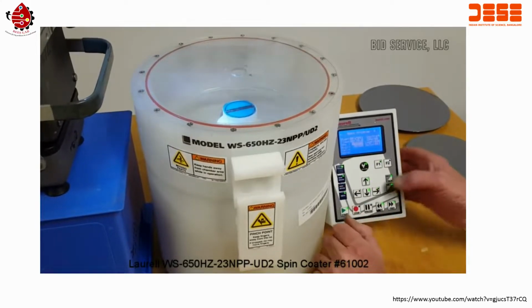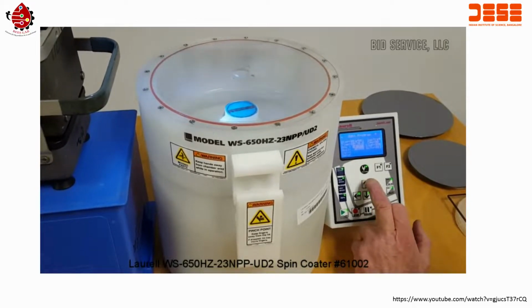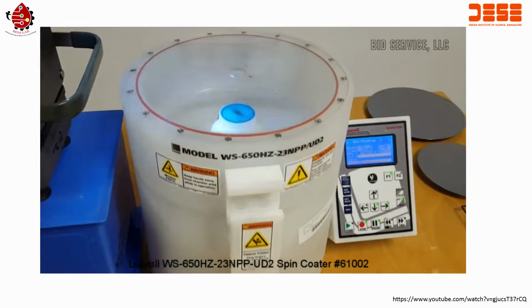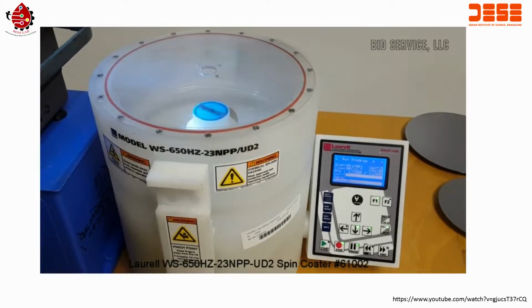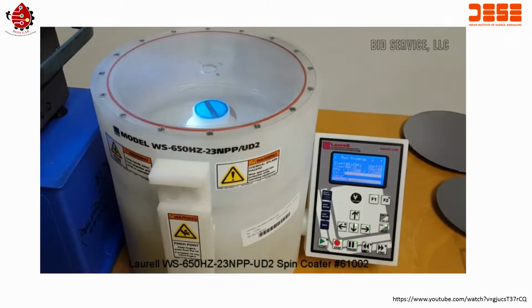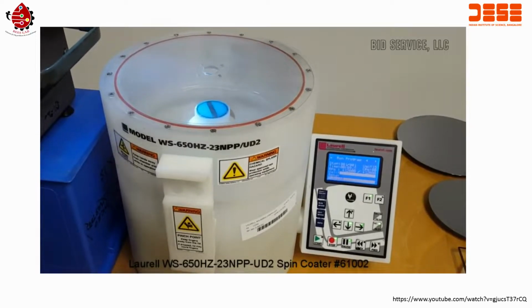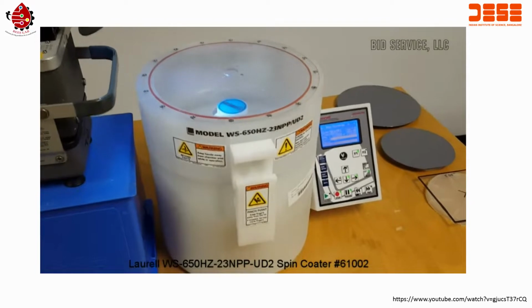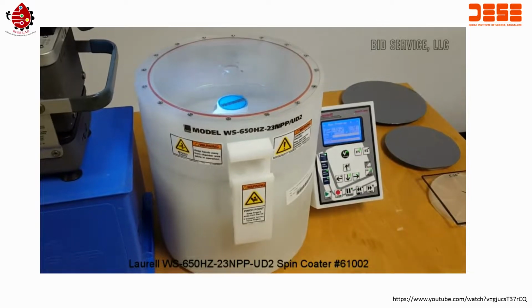We'll do one more spin, and we'll do this at the maximum RPM of 12,000. So, one, and go. Done.